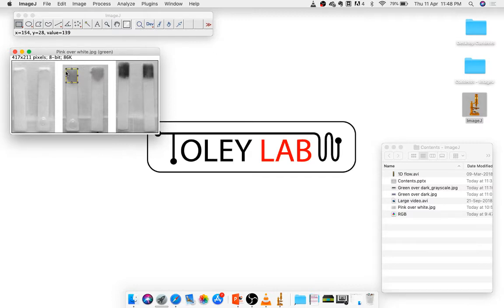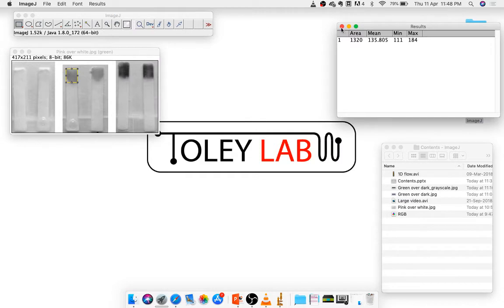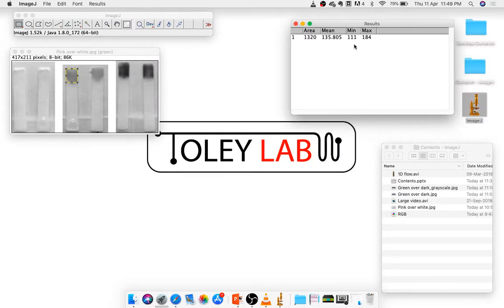If I want to get the average intensity in this region, I can say analyze, measure. I'm basically measuring the region of interest. And it's showing me the minimum intensity, maximum intensity, and the mean intensity. The mean is often what we are interested in. So this has a mean intensity of 135.